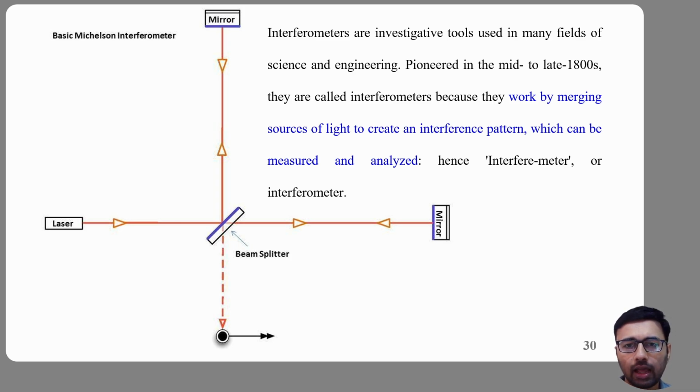Unlike a traditional IR spectrum, which plots absorbance versus wave number, an interferogram plots signal intensity versus mirror distance. Initially, the interferogram may appear confusing or noisy, but hidden inside it is the complete spectral information of the sample.